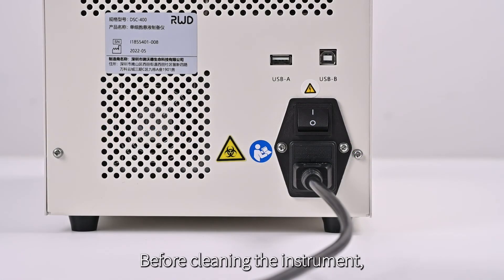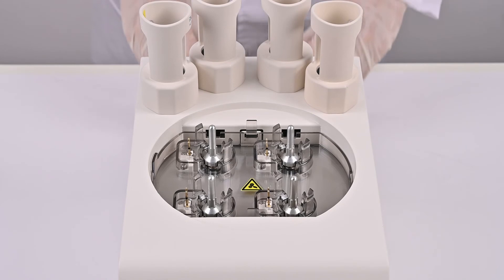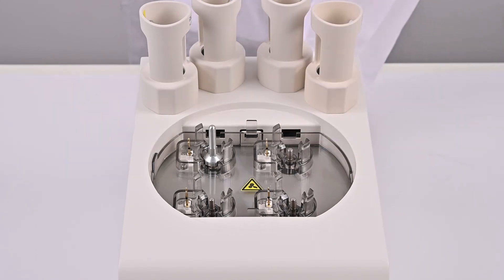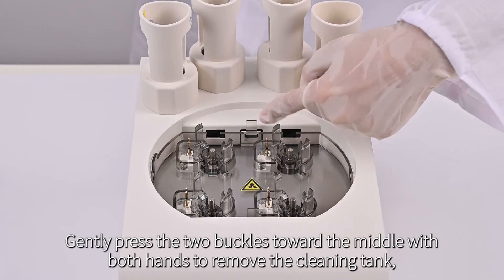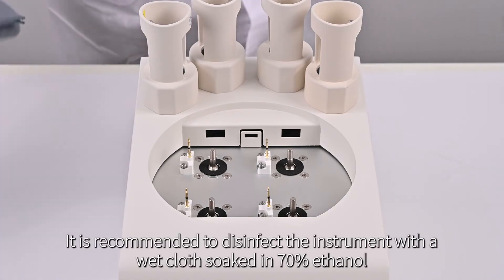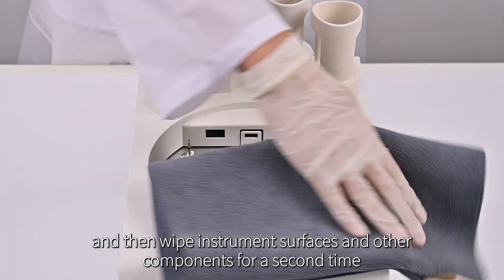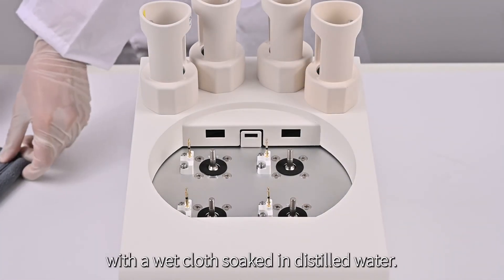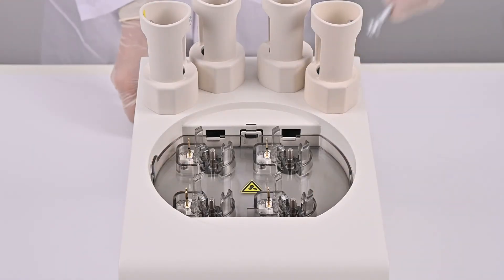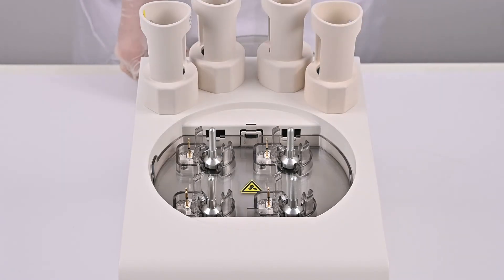Maintenance. Before cleaning the instrument, turn off the power switch and unplug the power cord. Lift the shield up to remove it, then remove the metal bushing. Gently press the two buckles toward the middle with both hands to remove the cleaning tank. Use a pipette if liquid is found in the tank. Disinfect the instrument with a wet cloth soaked in 70% ethanol, then wipe all surfaces and components with a wet cloth soaked in distilled water. Reinstall the cleaning tank, bushings, and shields.